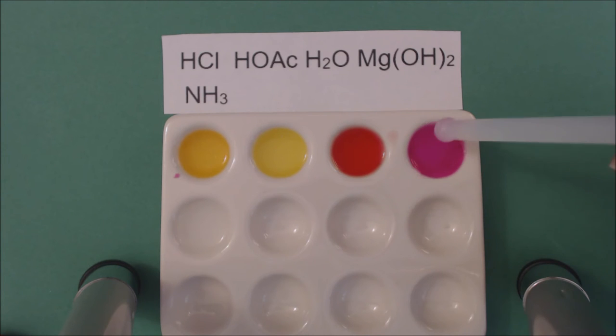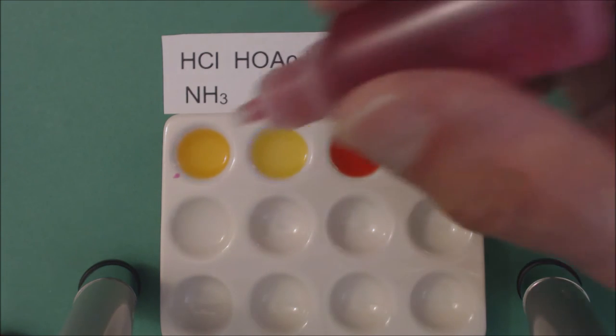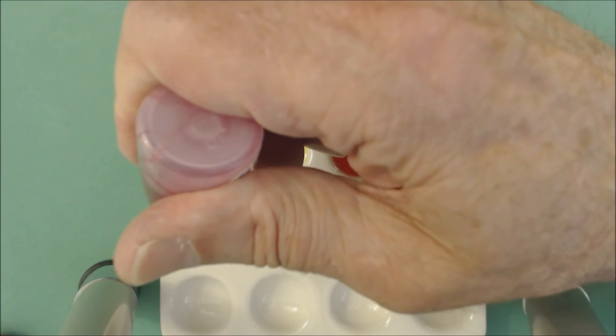Milk of magnesia—you can see that that's really more pink, this is kind of a reddish orange. And finally, the ammonia.